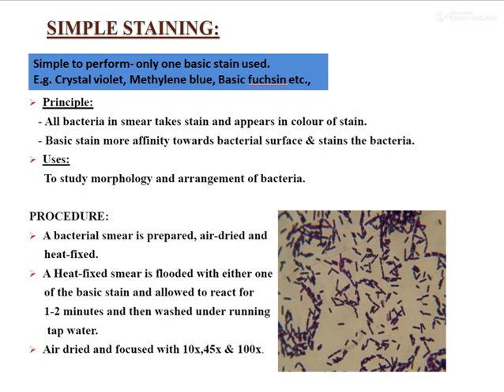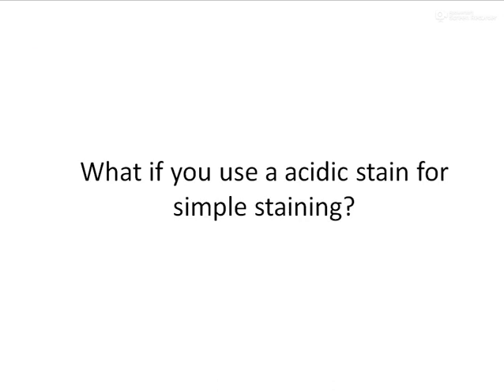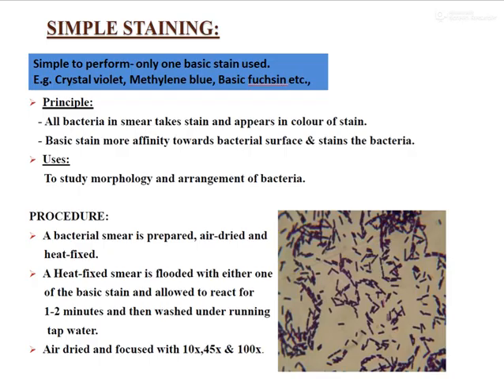The oil immersion microscopy is being done in the 100x mode. Okay, so let me ask you: in the first case, I told you in the simple staining technique, we use a basic stain. I guess you recollect. We are using here crystal violet, methylene blue, basic fuchsin.